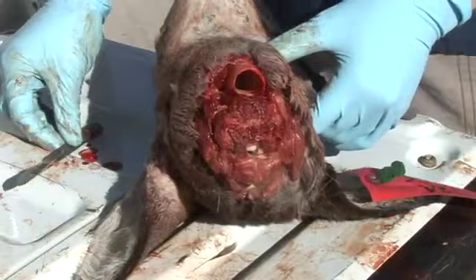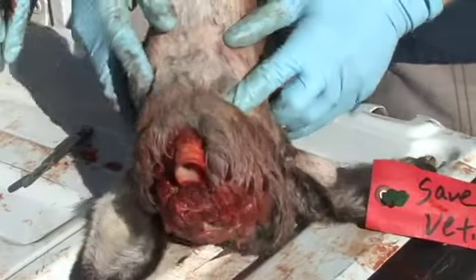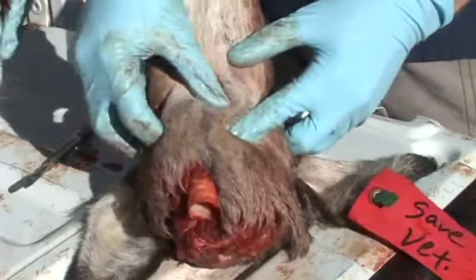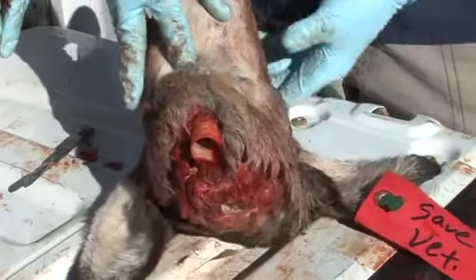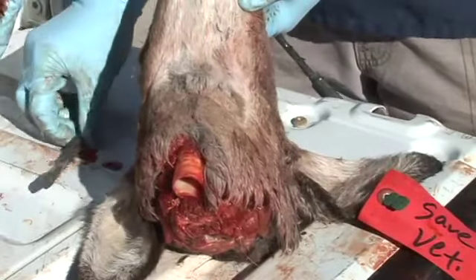Here's another example of retracting the larynx.